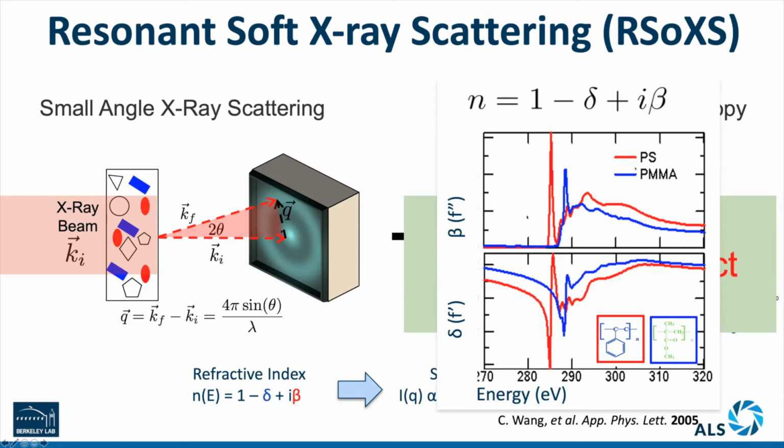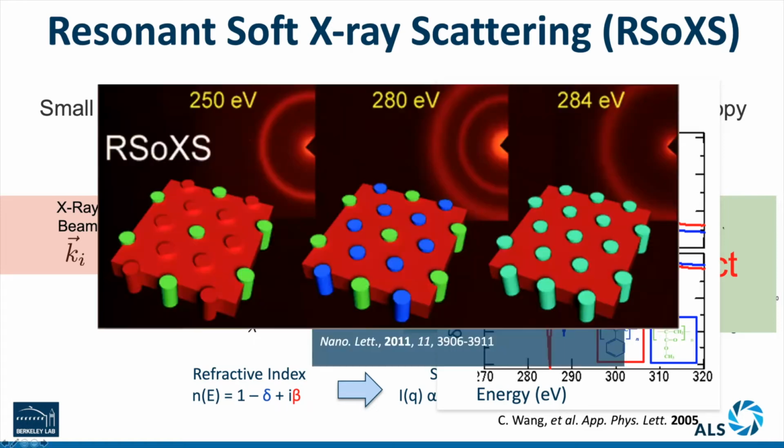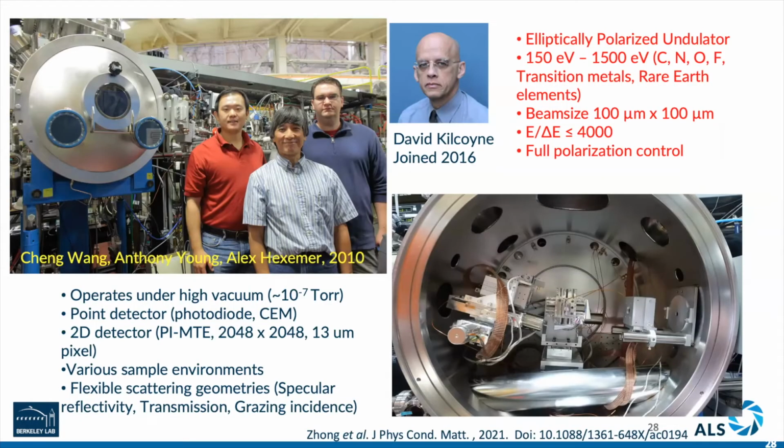I think if you have a two-phase system, that's really not a big issue. Conventional scattering will give you the picture you want. But when you have more than two phases, say three polymers, then you want to decouple the scattering contribution, and I think this becomes very, very powerful. As reflected in this example here, we have an ABC tri-block polymer forming a complex phase, A and B and C phase. By tuning the soft X-ray energies, we tune the scattering contribution of each component, and then we can go back and figure out how each phase contributes to the scattering, and identify what the structure looks like unambiguously.